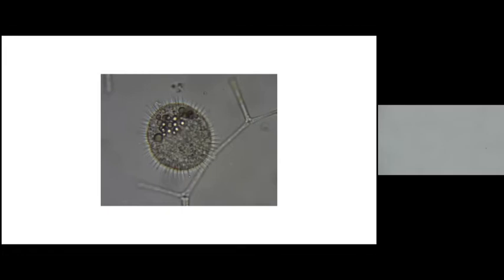So since we can kind of see the entire object, one observation I made is that it doesn't have any limbs, but we can see the entire thing. So I would assume that it doesn't need to move itself, and therefore I would assume that it might be moved by something else. And that brought me to think about what could be moving it. Does anyone have any guesses as to what could move it? Air, water?